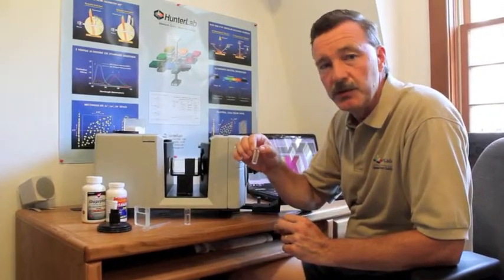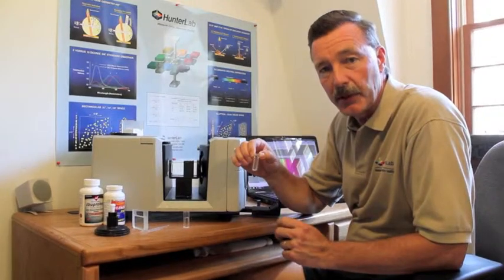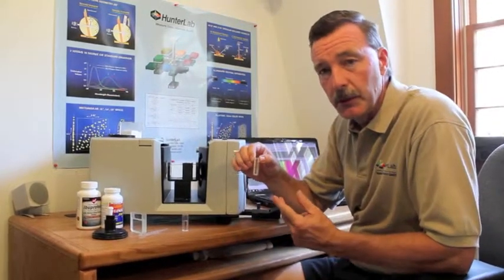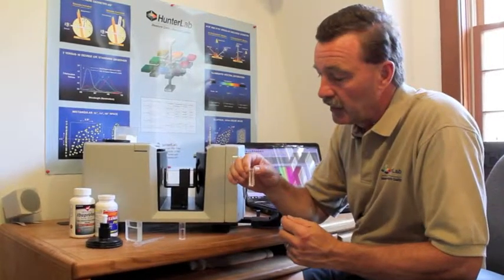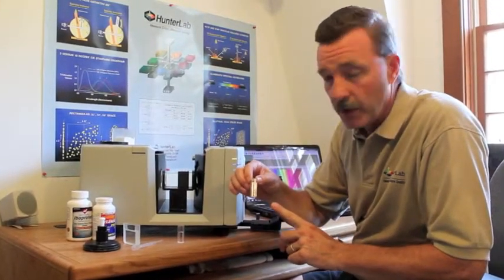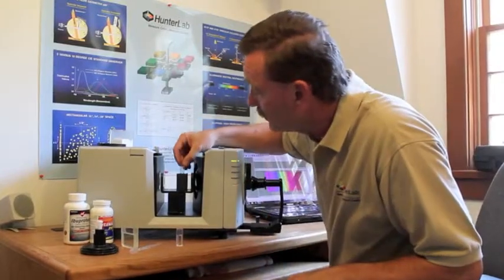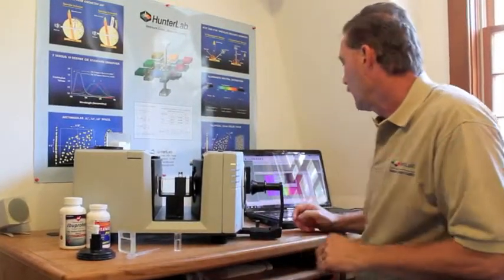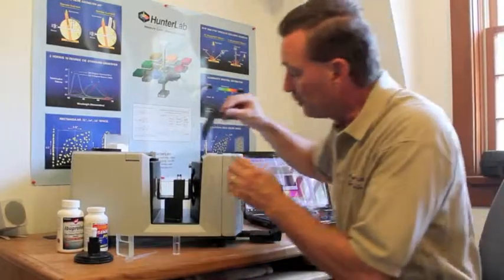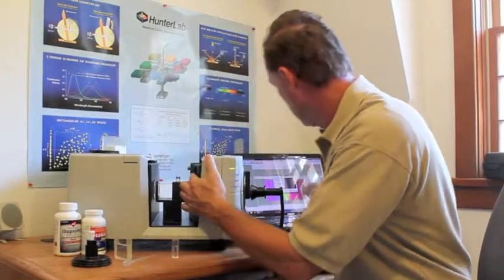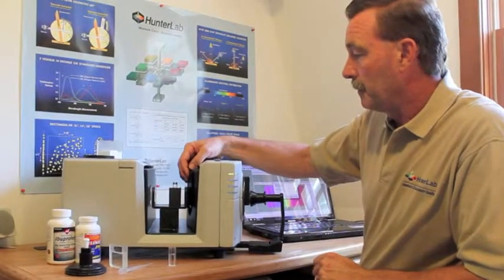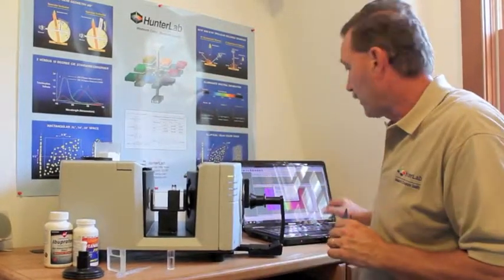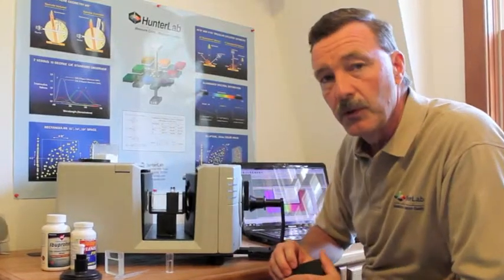When we standardize, we use our semi-microcell used in many UV Viz applications. It could be quartz, high-quality, or simple, inexpensive polystyrene. I first fill the cell with DI water, place it in my holder, and begin the standardization by first blocking the beam, and then open path with the cell filled with DI water.